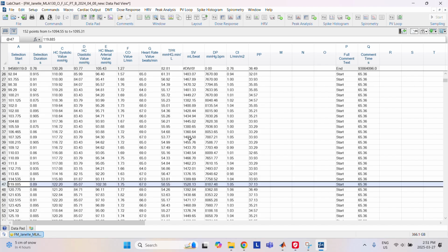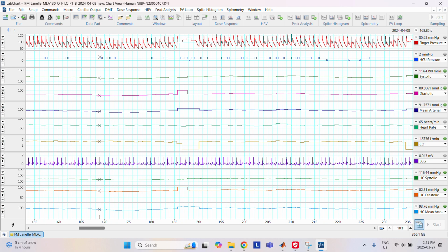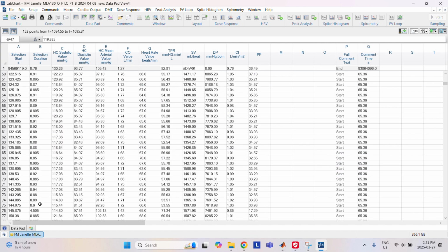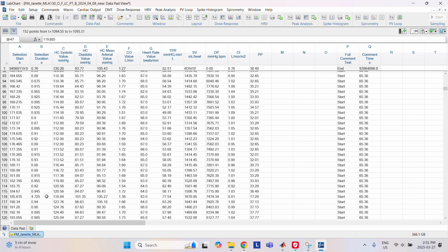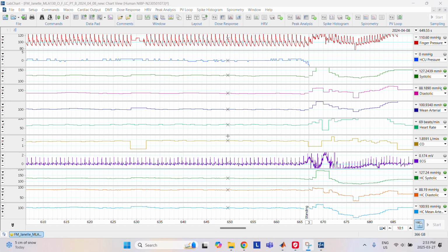I'm gonna pause recording right now because the file is going to be too long, but I hope you get the point. You want to go through every point of calibration and remove the corresponding point from the data pad. So 185, and then I'll return when we get to the point of the noise. Okay, 185, just this part, and then you want to remove that.